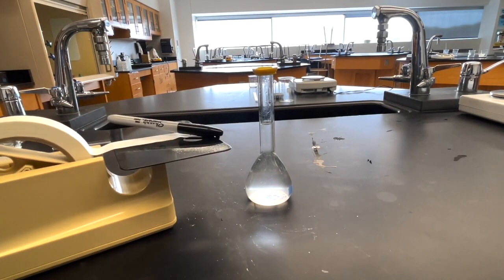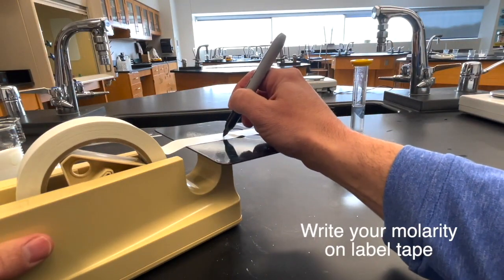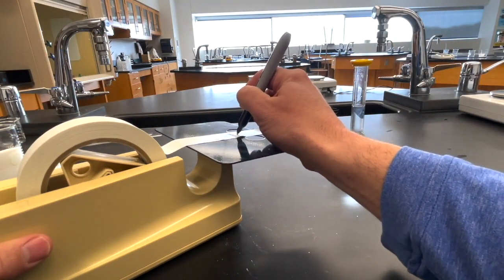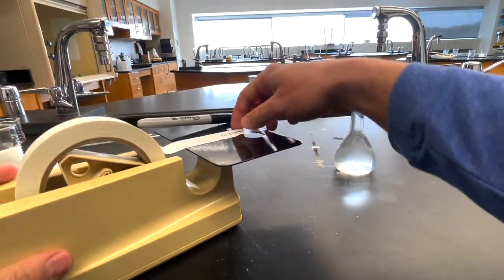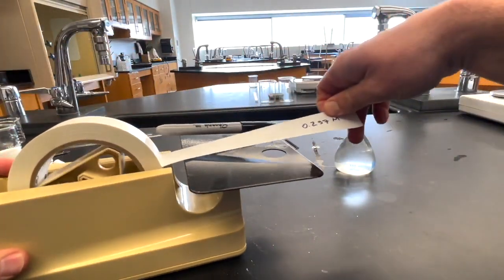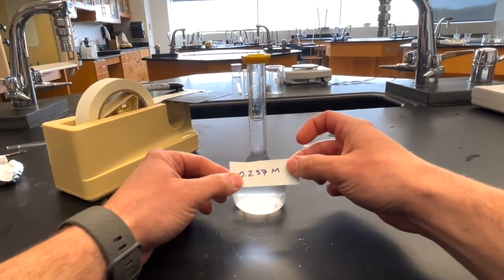Now it's a good idea, once you've figured out the molarity of your solution, or maybe you already know the molarity of the solution and you've made it, go back and label the molarity using a piece of tape, so that just in case the bottles get mixed up, maybe another group makes a solution that's a different concentration and they might look the same, but yours is labeled with the proper molarity.